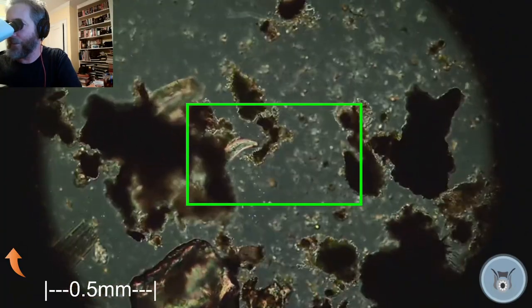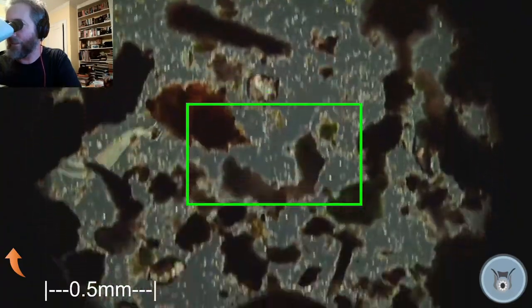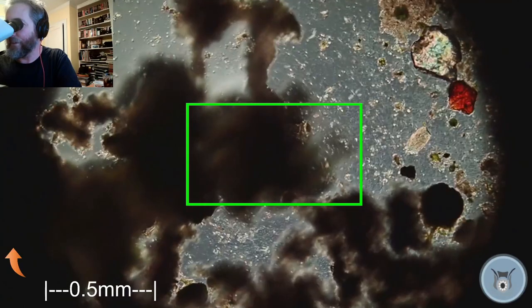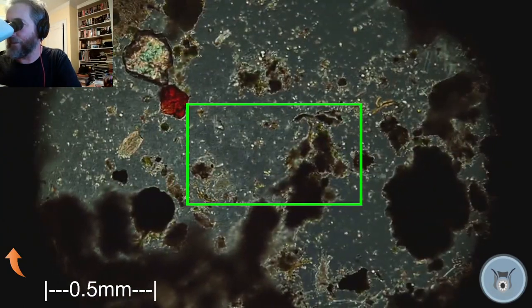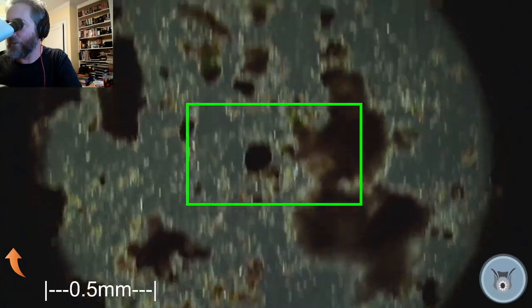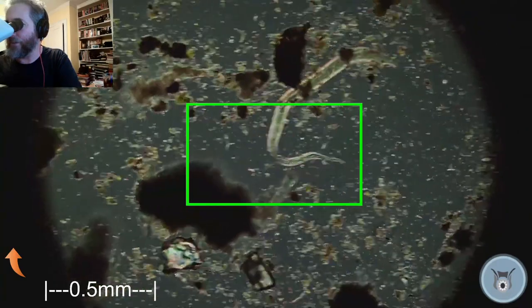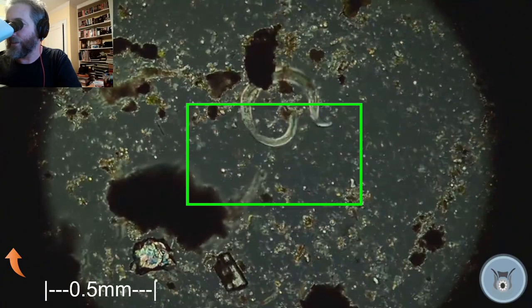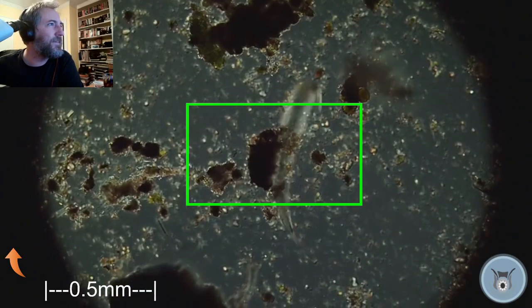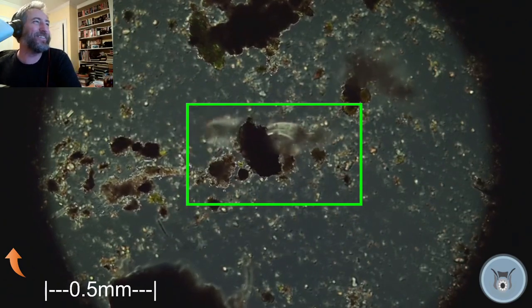Let's see if we can find a bigger one. Rotifers also come in all kinds of sizes there. That's the bit of the butterfly wing. Not wing, but scale. Let's see if we can find another one. There's a bunch of different rotifers that might be around in here. Usually they're easier to find than water bears are. Like the nematodes, they also, like there's another nematode, they tend to wiggle stuff around a lot. And you see that nematode, they just have a characteristic motion, kind of dancing. Yeah, a little bit like a rave.